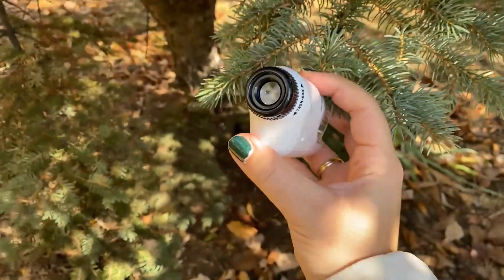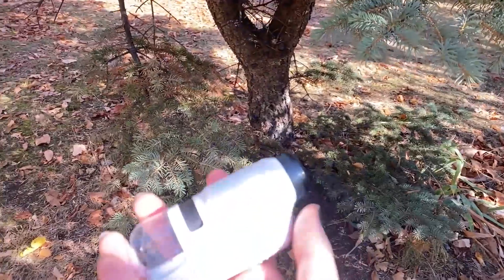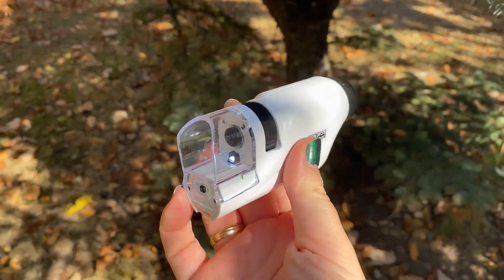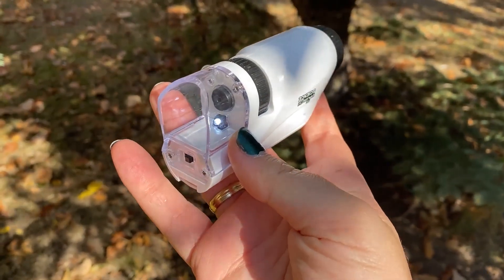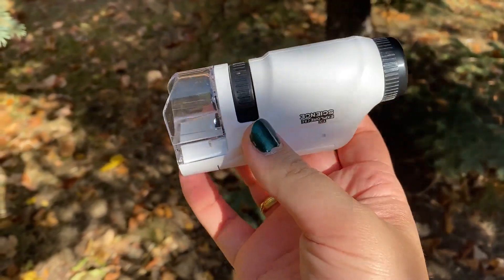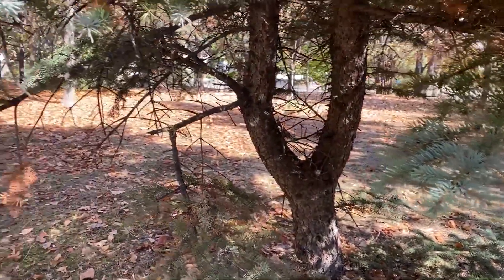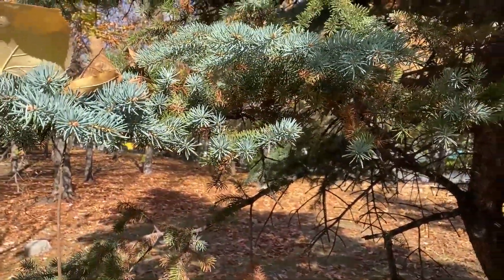Wow, you can actually see the stem and the tiny needles of this pine tree. I'll move them for you — it's very hard. Wow, it's amazing! This is what you've been seeing. I can't believe this is only 15 bucks — this should cost more. I know it's Chinese and the light takes a lot of banging to turn on, mine's a little buggy and wonky, but yeah, this is amazing. I can't wait for my kids to grow up and be six or seven years old and be interested in all of this.